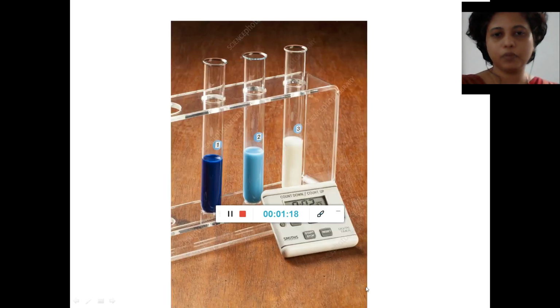Now this is a methylene blue reductase test which has been performed. This is a control milk which has been shown at three different time points. You have a different color. You take the milk, add methylene blue, and after some time, what happens? The blue color gets degraded, and depending upon the time it takes to degrade, the quality of the milk will be determined. So let's see how.